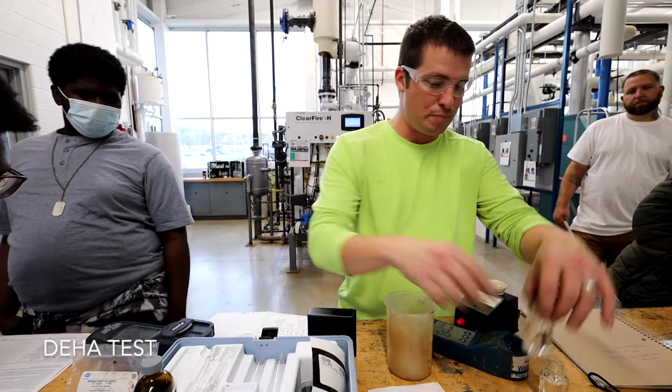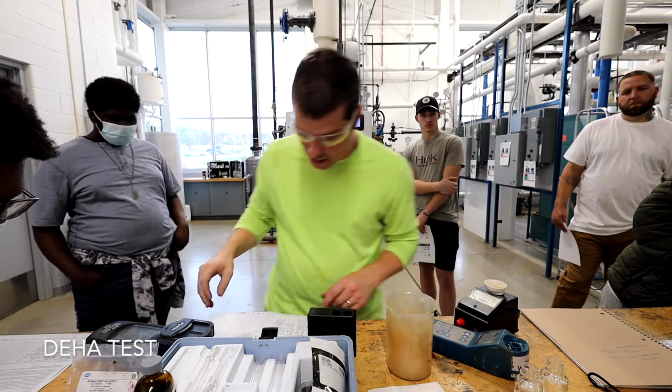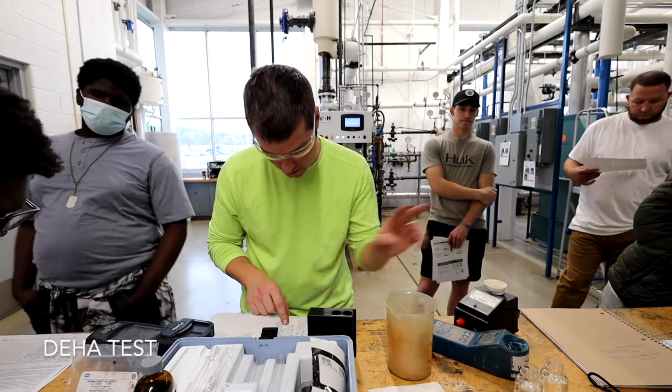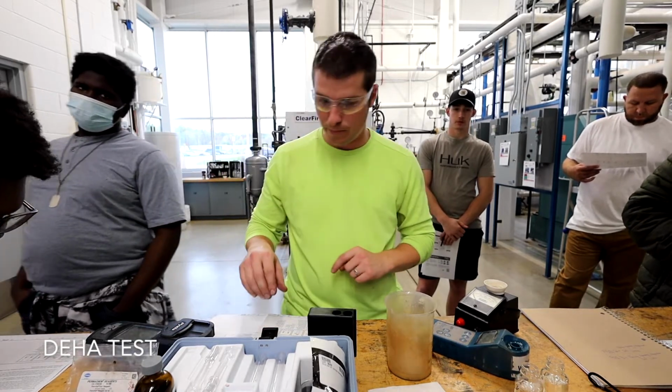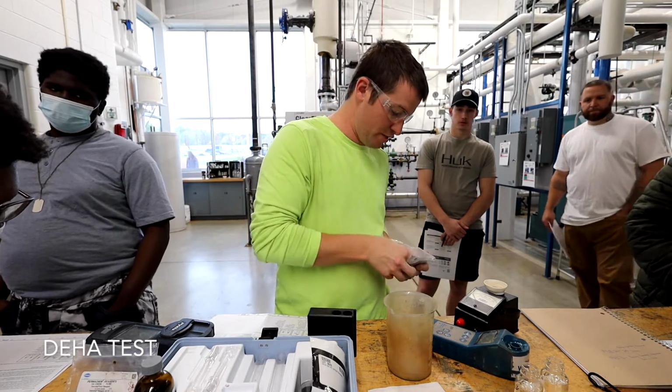Okay, so we filled it up with the 25 mils. This is why you got to mark them B and S, because otherwise how do you tell the difference between those two waters right now, right? So we go to the next step now that we've got our 2 sample bottles ready. Add 1 DHA 1 reagent powder pillow to each and swirl. So you have these little powder packets. We're gonna add 1 of these to each bottle.